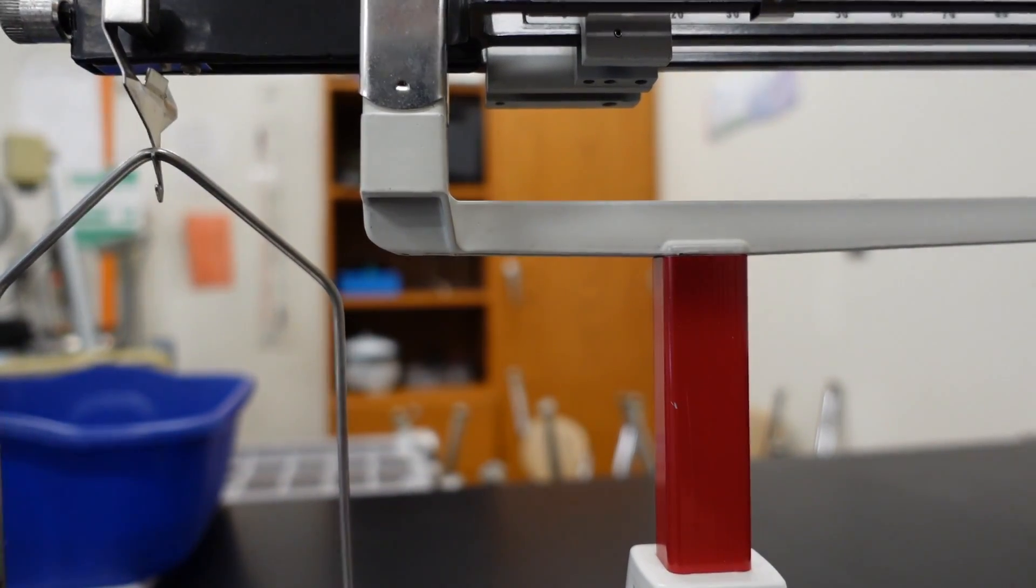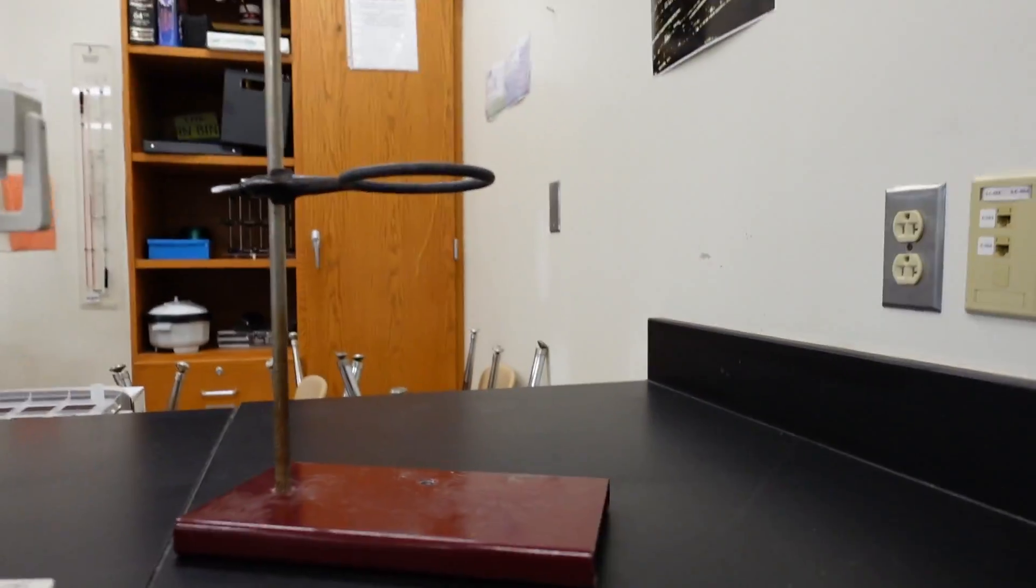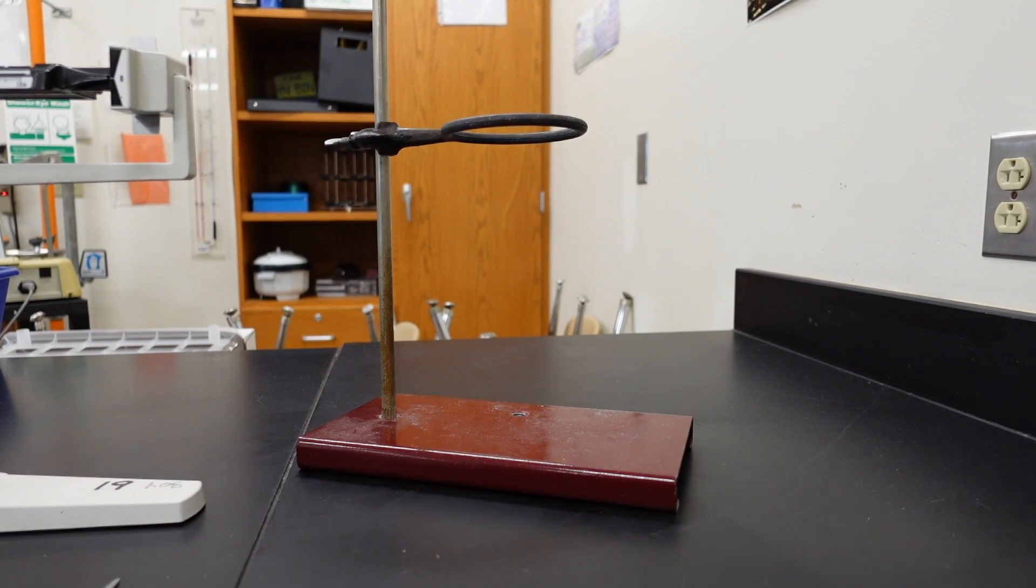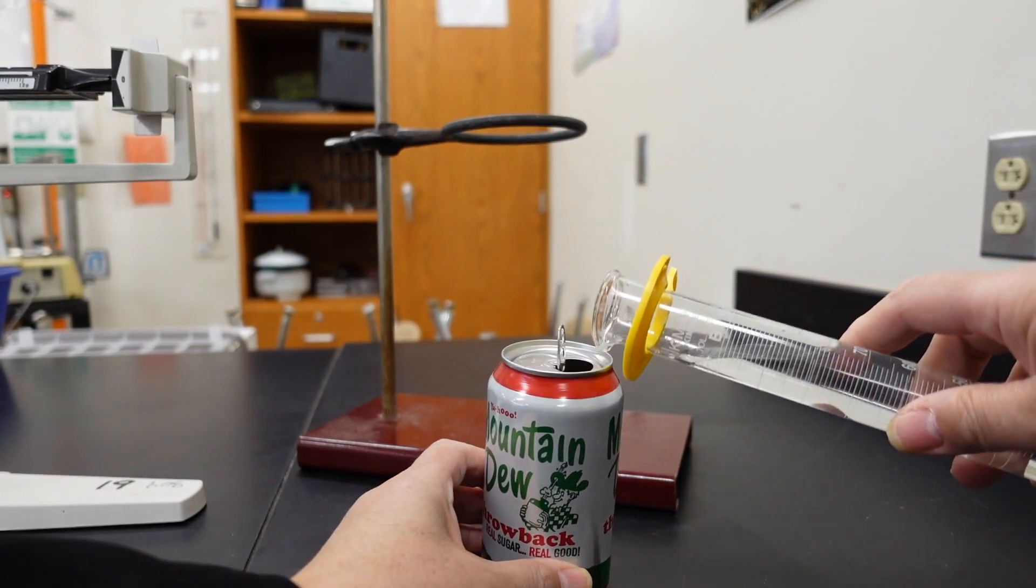All right, so that's the mass of the candle before we burn it. So now we're going to have to burn it. So let's have a look at what comes next. Let's get ready. We have a ring stand with a ring.